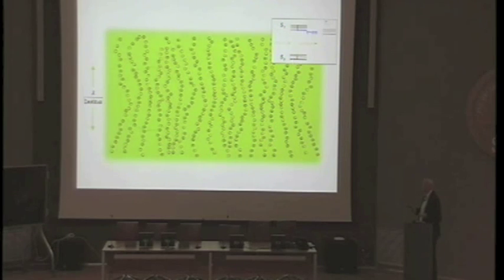If they absorb light, for example, green light, the molecule is raised from the ground state to the excited state, then the molecule relaxes again, but then it emits a photon, a light particle that is shifted to a longer wavelength, so from green to red. And this fluorescent light is actually what is being recorded. And this is how we see the molecule. So we don't see the actual proteins in here, we see the fluorophores, because that's what is made visible.